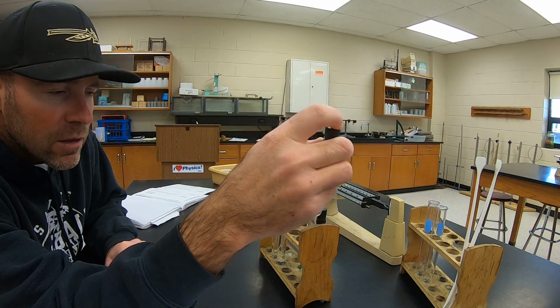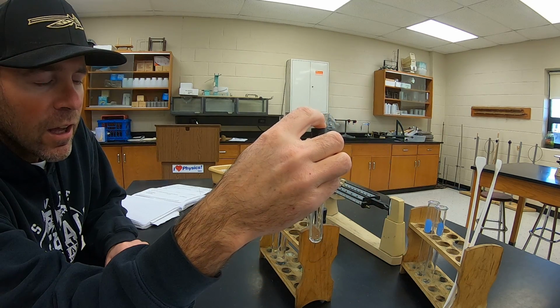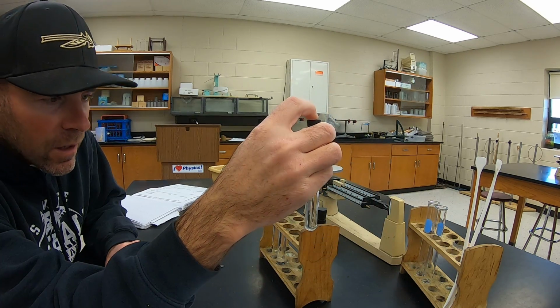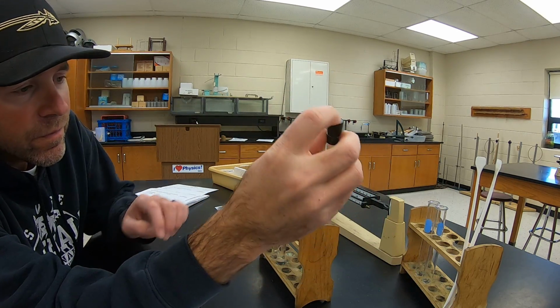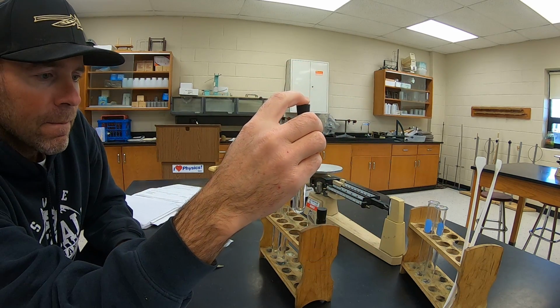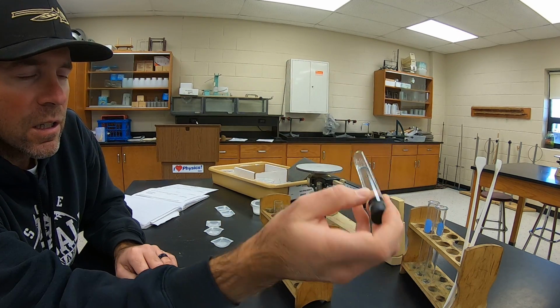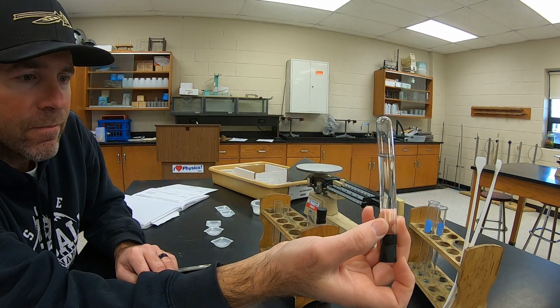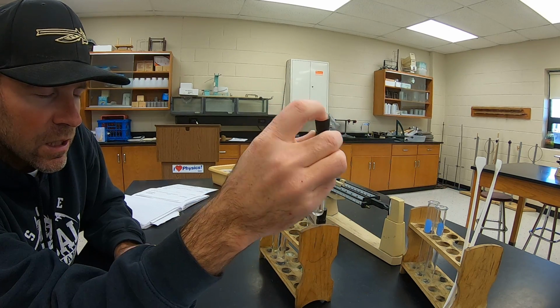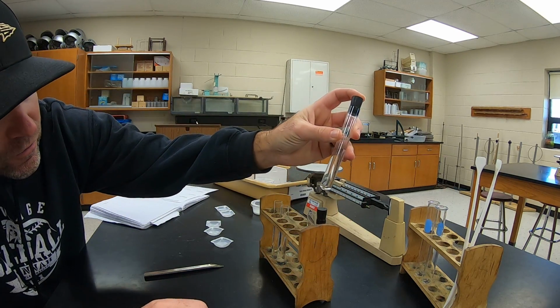There's 3. 4. 5. 6. 7. 8. You can still see the particles of salt down here. 9. 10. 11. 12. 13. 14. 15.